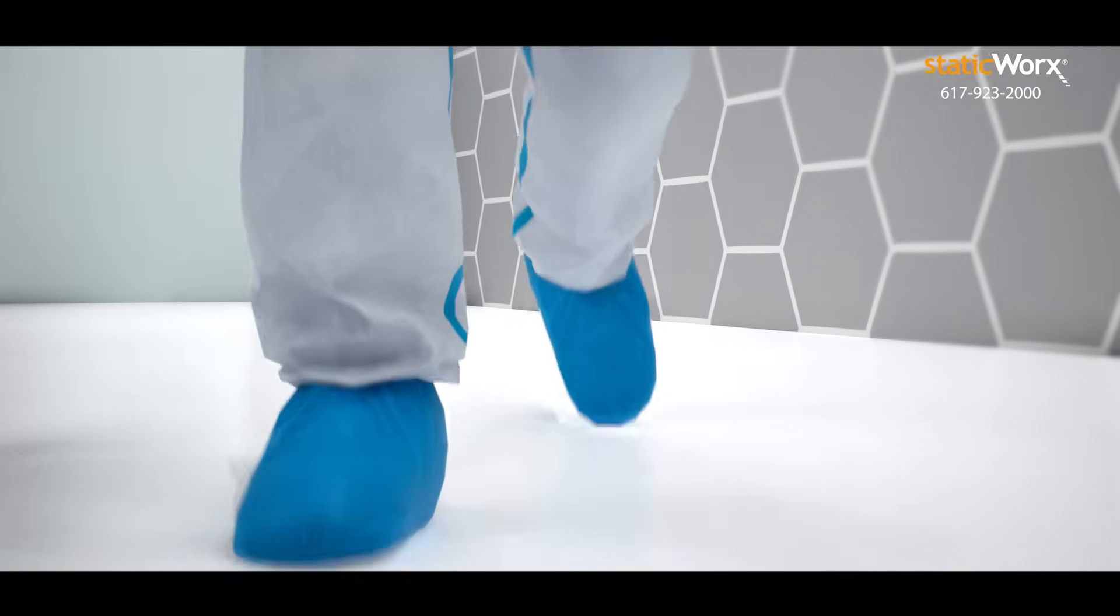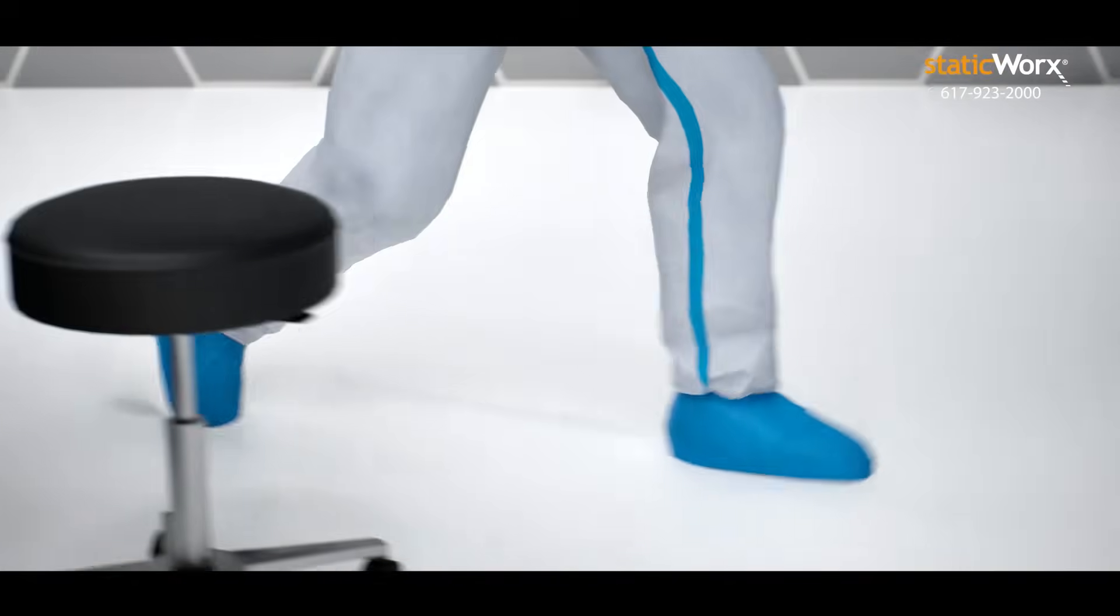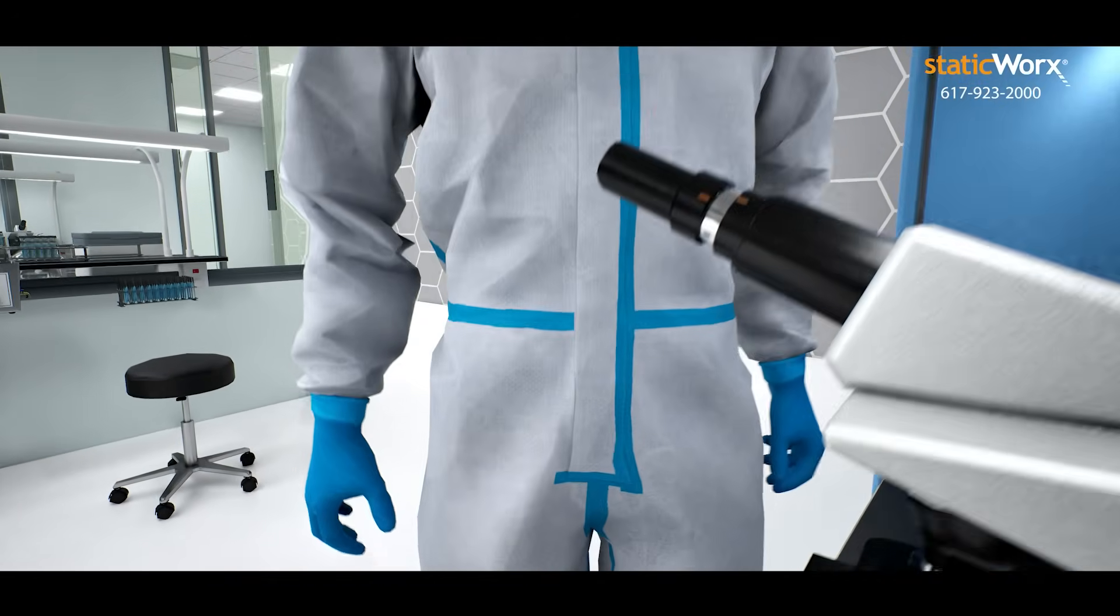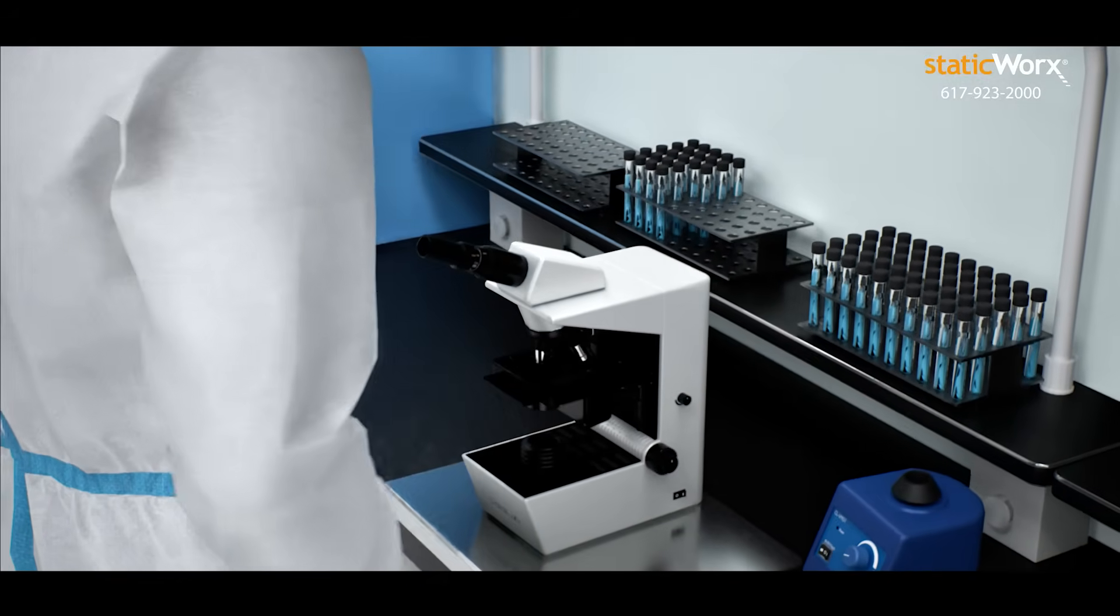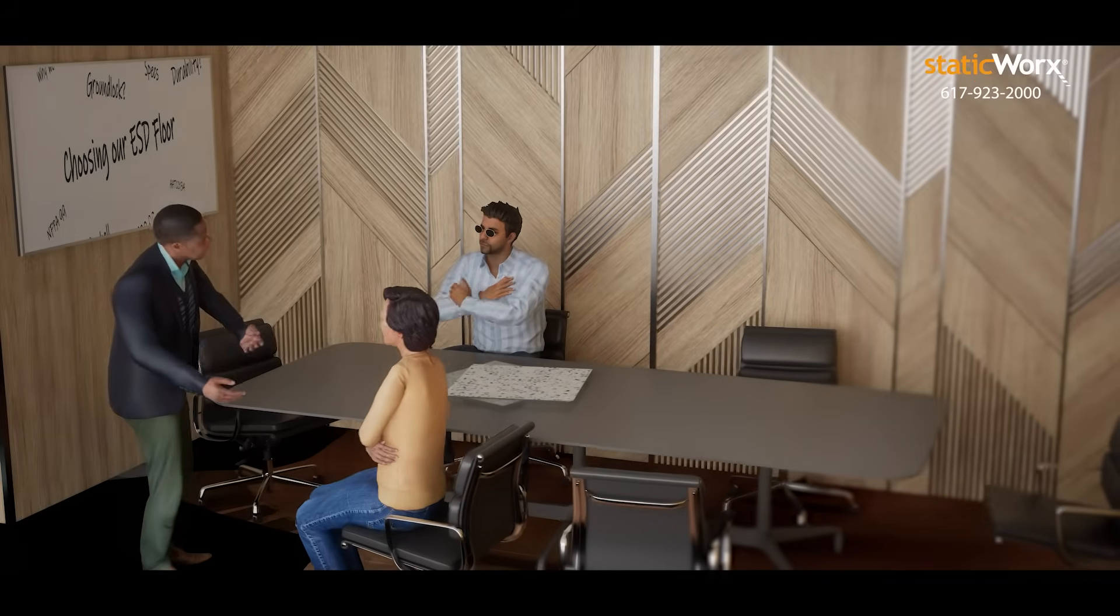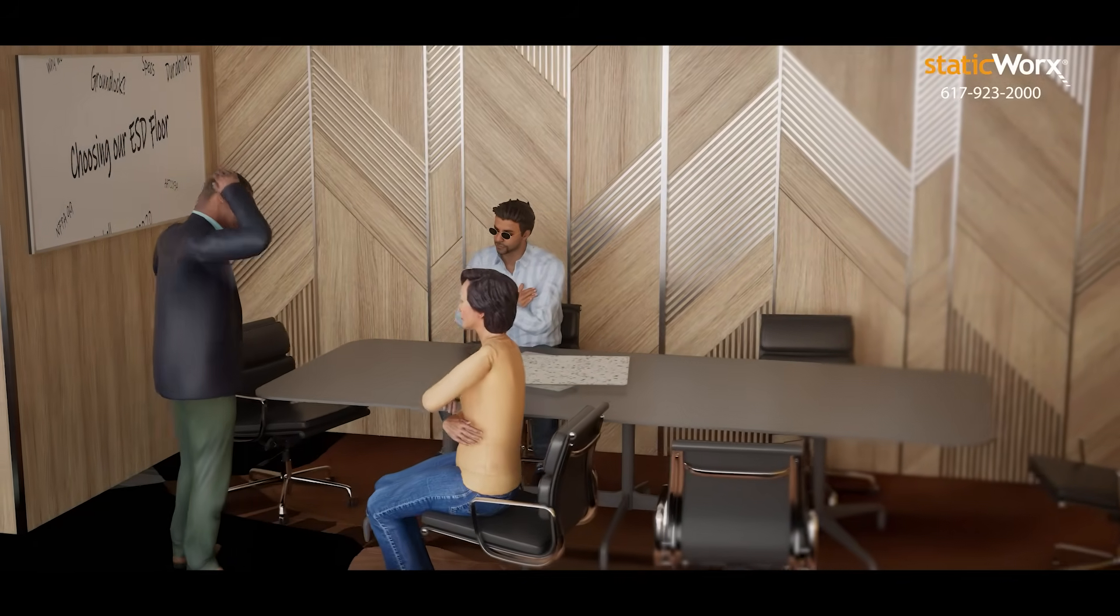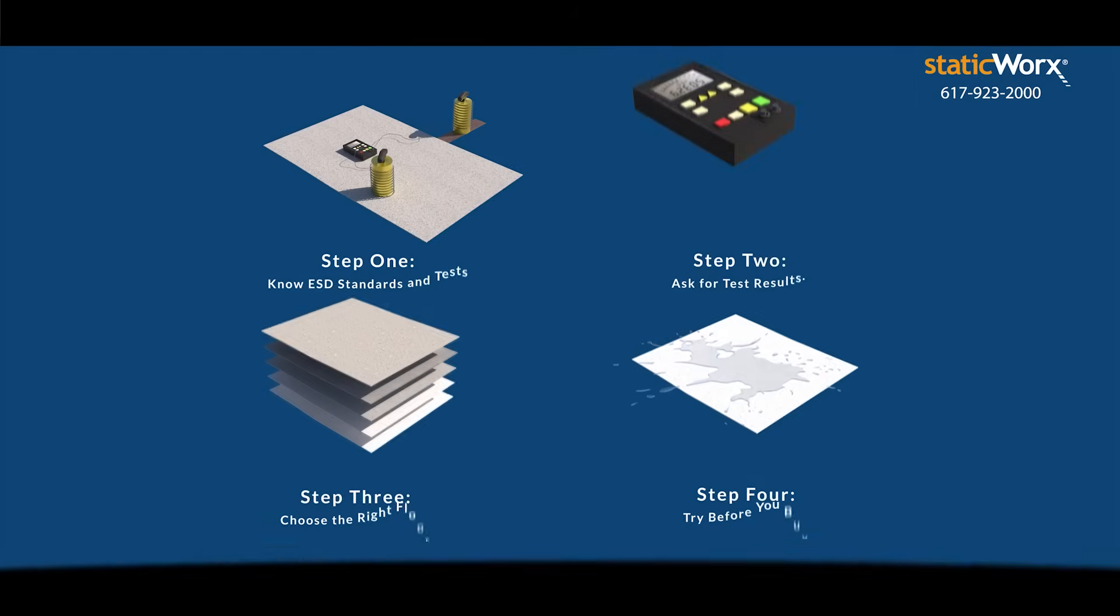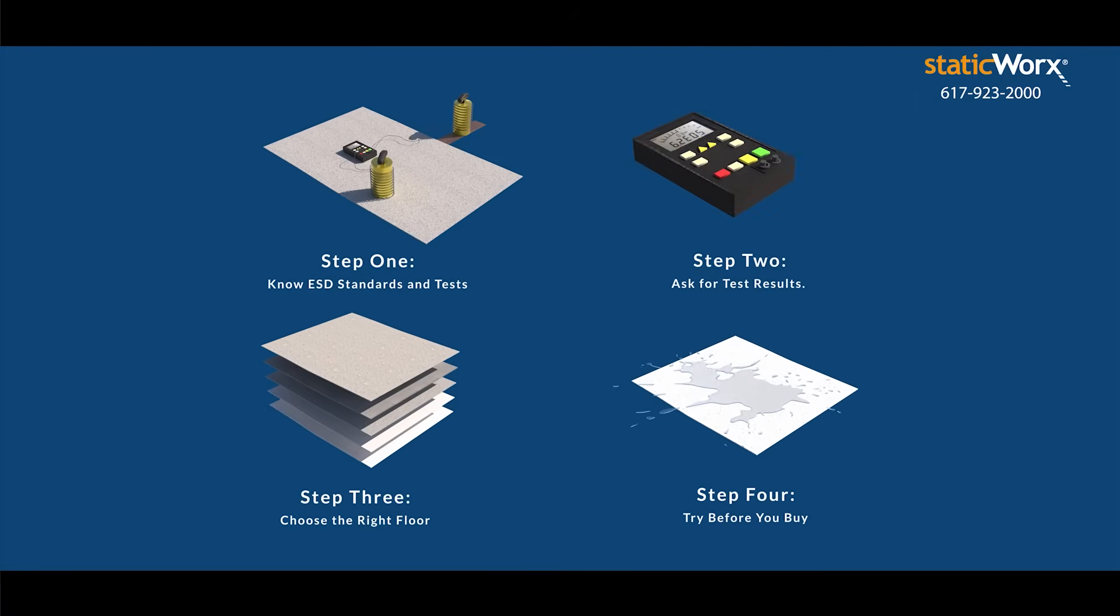Static electricity. A charge so small you can't see, hear, or feel it can damage or even destroy your electronics. That's why you need an ESD floor. Choosing the right ESD floor for your lab or clean room isn't complicated if you follow four critical steps. Let's break it down.